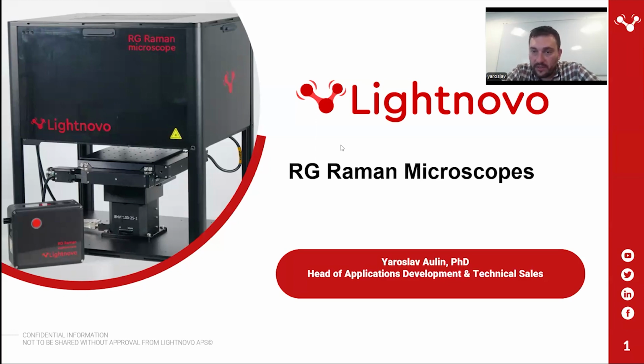How about chemometrics like a PCA or MCR to get the image, not just peak height? Yes, it's possible and it's inbuilt in the software, and I think we'll have a separate webinar on advanced features of MiroSpec, like data analysis, where we just focus on the advanced data analysis methods. So any other questions? Please, if you have any questions, just type them in the chat.